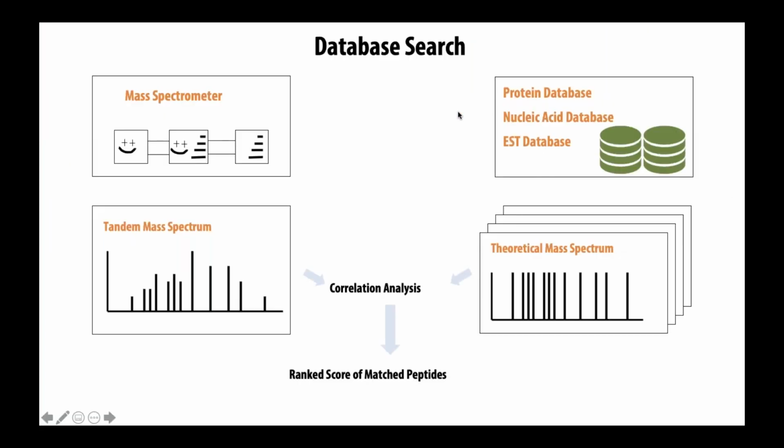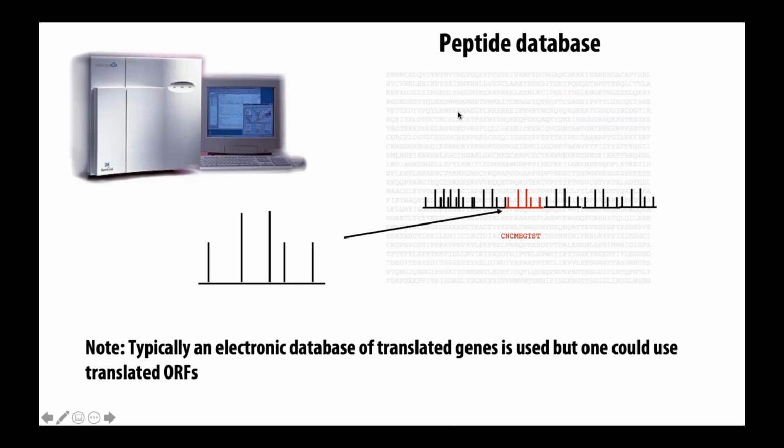Okay, so let's keep going. Okay, and that's basically now you can map the signature, this peptide signature, back to the protein, and that's how you can determine what proteins showed up in your particular experiment.